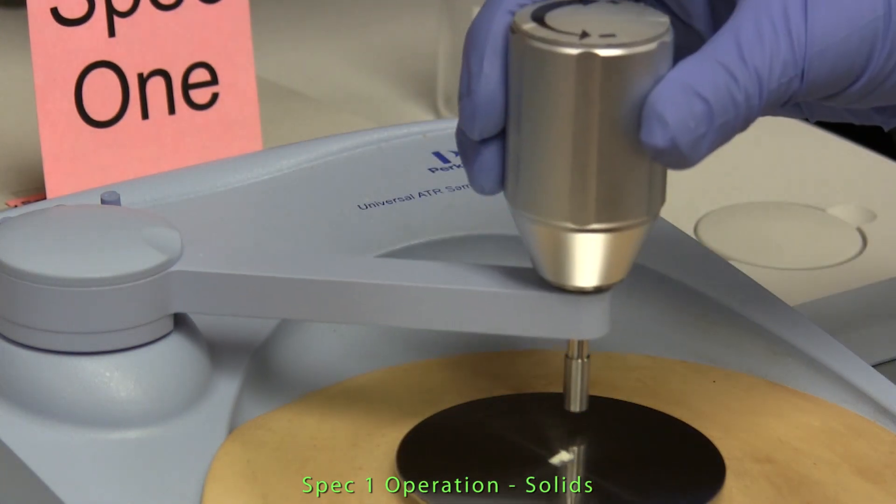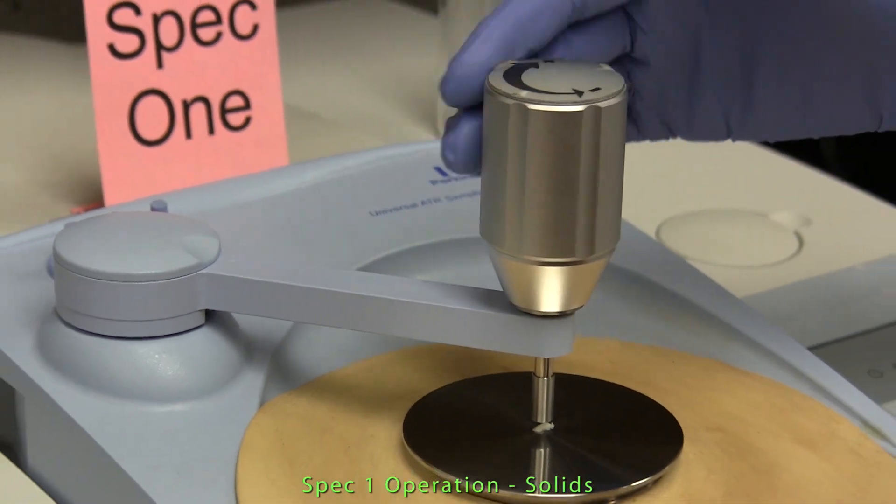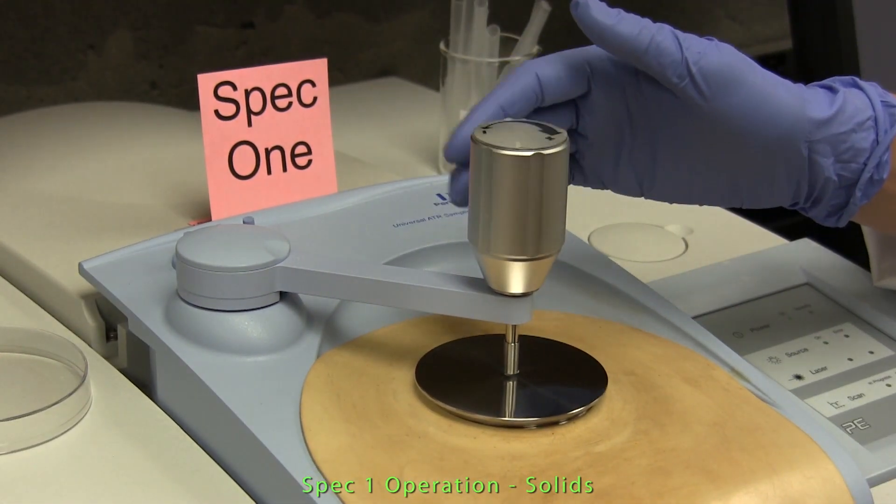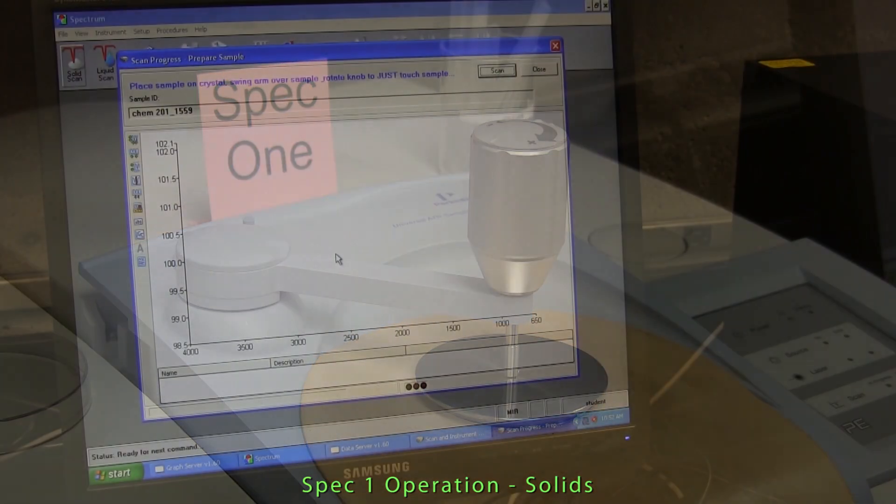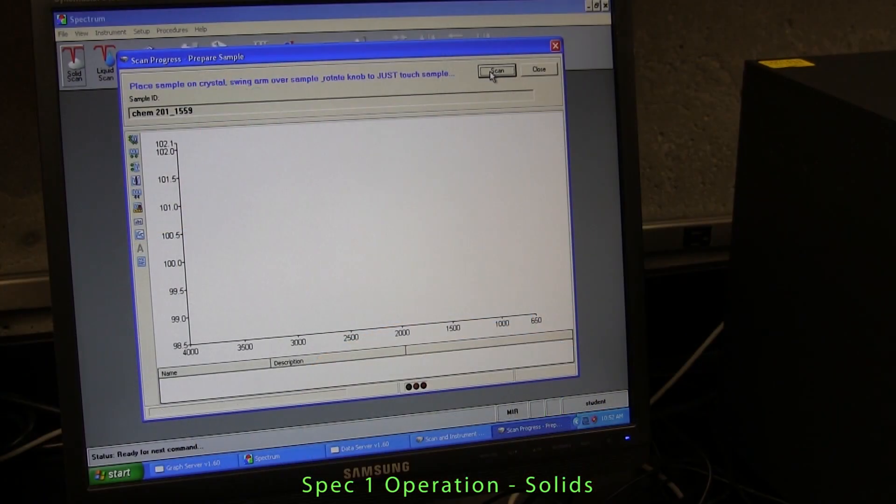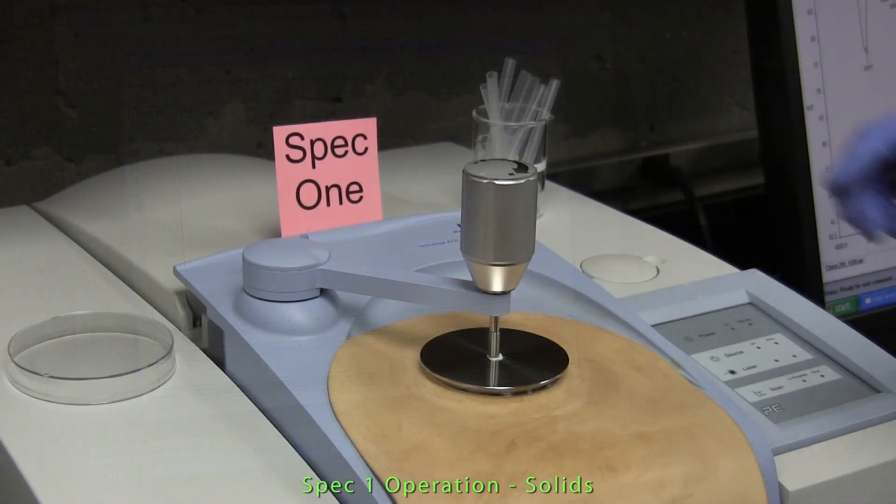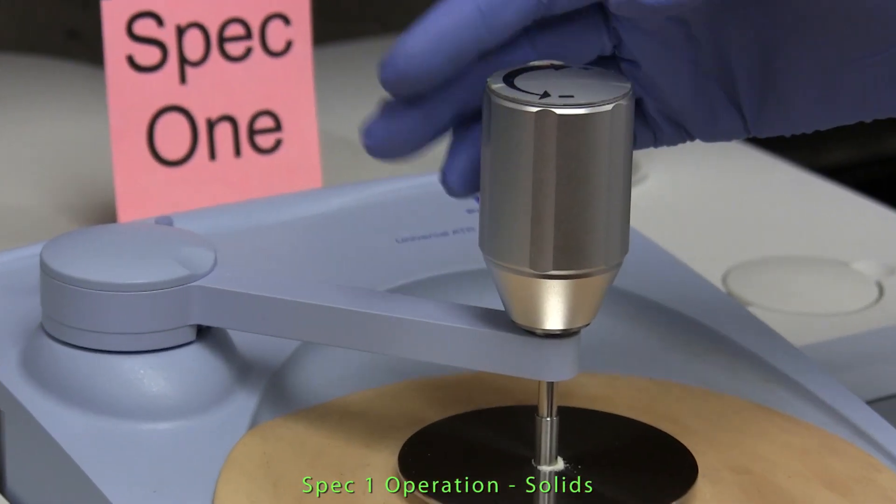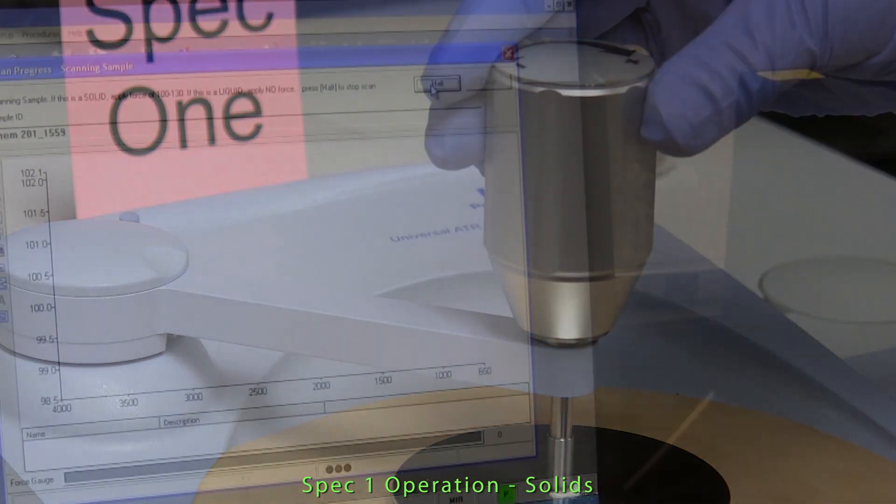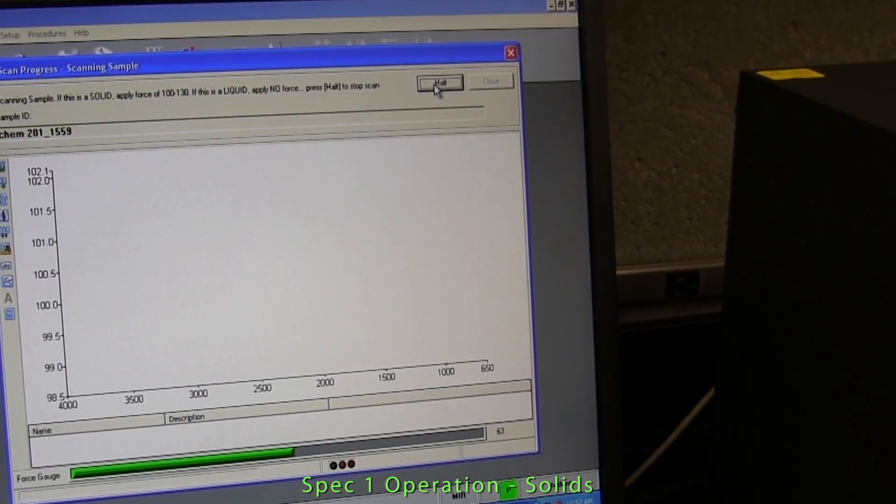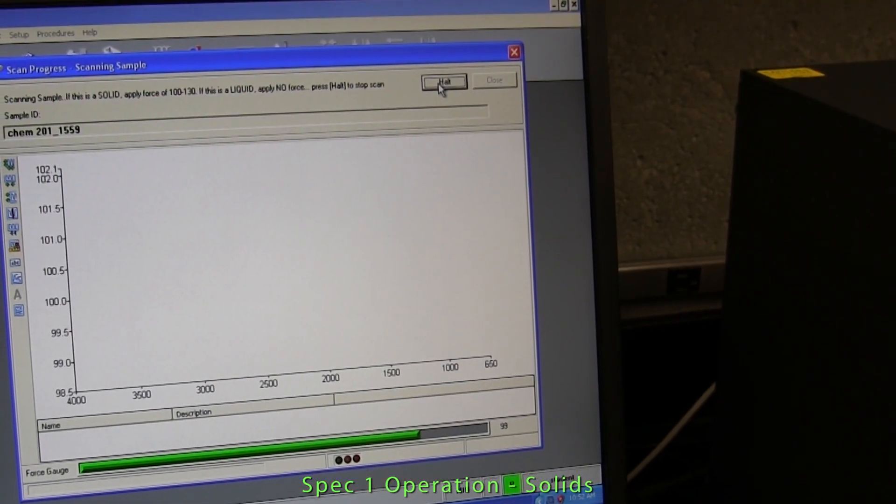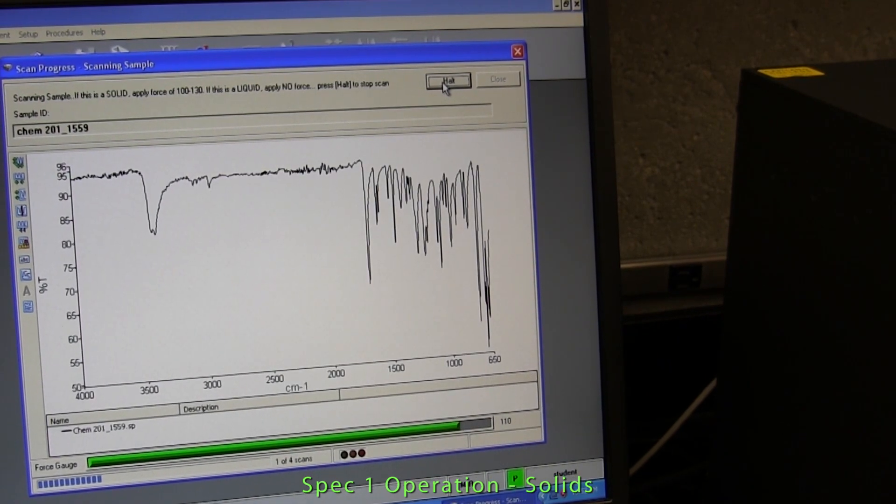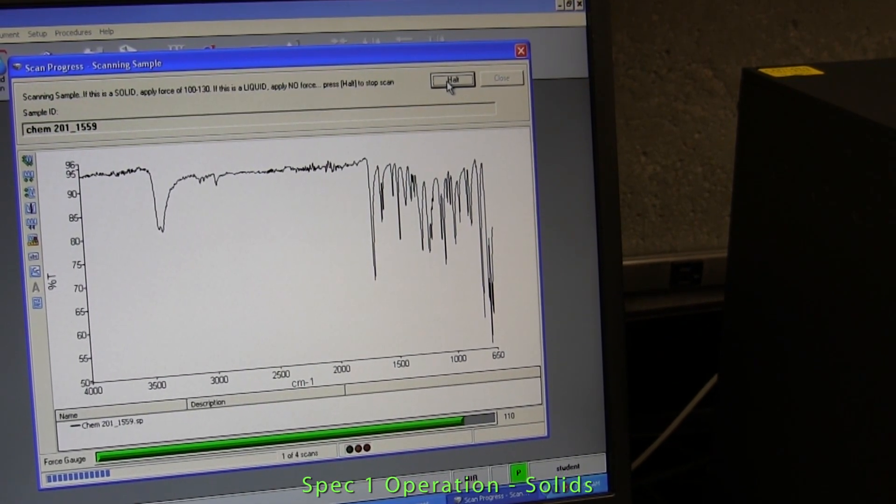The pressure arm is swung over the top of the sample and the knob rotated until it just touches the sample. When you click on the scan icon, you should rotate the pressure arm knob again, this time until the force gauge indicates a pressure of between 100 and 130. The force gauge is visible as a green bar at the bottom of the screen, which shows the spectrum being collected.